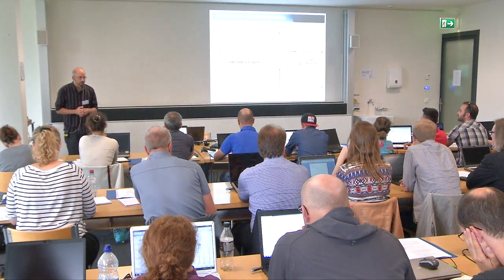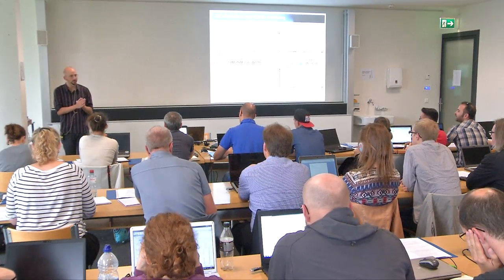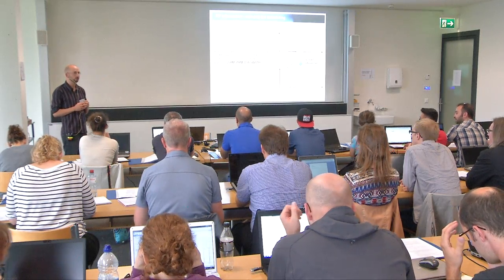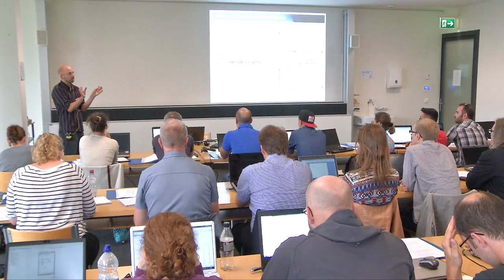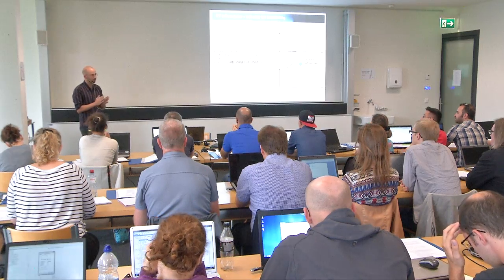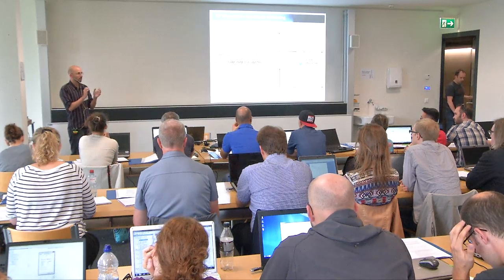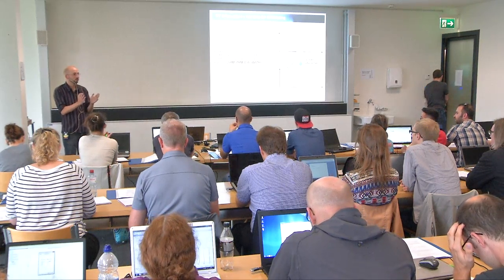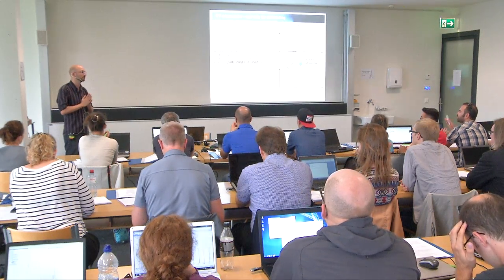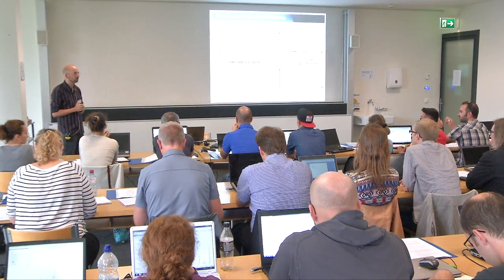Mm-hmm. So in the case of targeted measurements, you will have different transitions, so different pairs of Q1, Q3. These are going to be separate peaks, and then the only question is a question of chromatographic resolution. So if you have a very short gradient and these peptides have the same Q1, Q3 pairs, for example, for some reason, and they will also coelute chromatographically, then Skyline will not solve this problem. It's up to you to improve them. Otherwise you will get two different peaks, and that's not a problem.